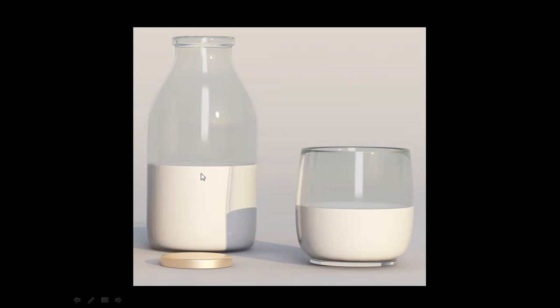Either by 50 ml on the first day or in the next batch of the process also, we'll be getting the same volume of preparation with the same concentration. So there is no concentration difference between the batches. So that is why the final volume we can adjust into a rounded volume.